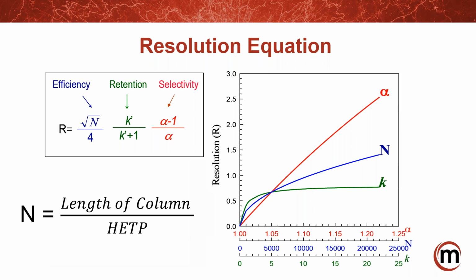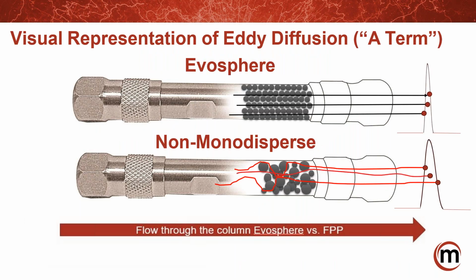I go into more deeper discussion on calculation of plates in version 1 of the webinar. So I suggest you look at that to get a view of the expanded Van Deemter as well, and how to calculate it, and how the A term is really what's going to be driving the efficiency here. So what we show is what it looks like with a pictorial version, and the A term in the Van Deemter equation is referencing your multipath effect.